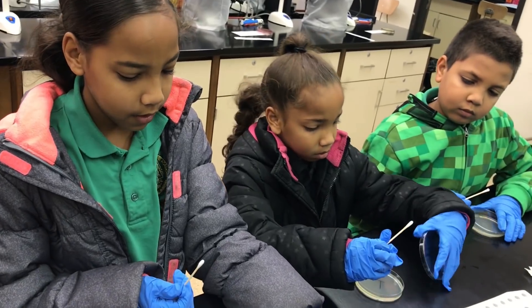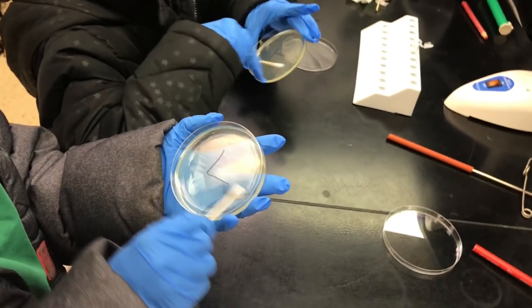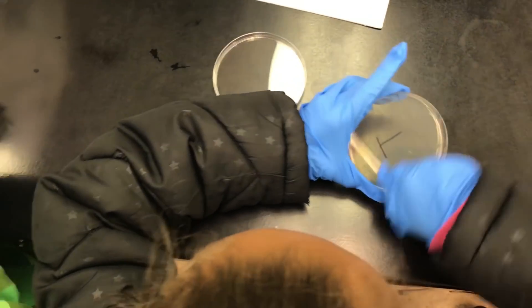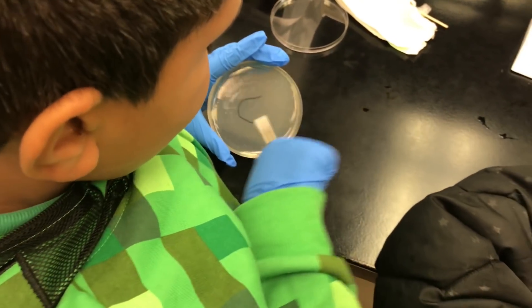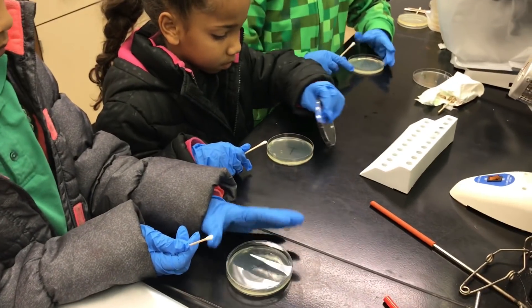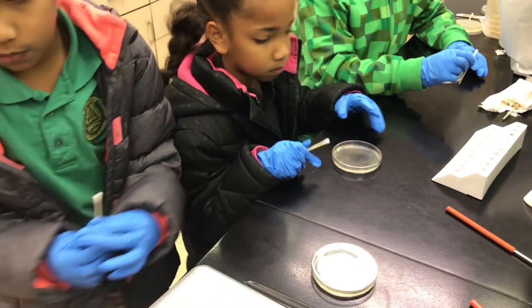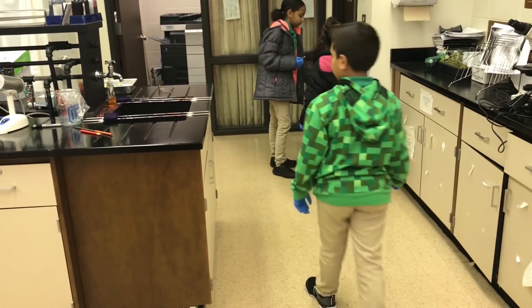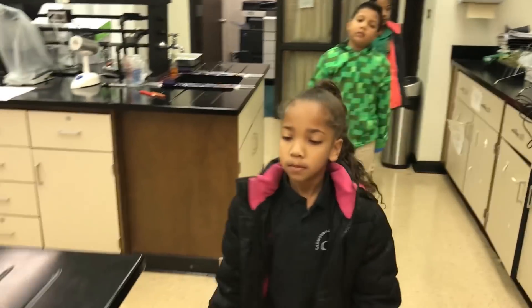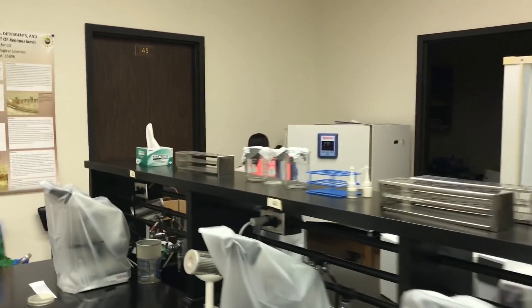That is good. We're gonna put it on a tryptic soy plate. Put it all on there. So now we're good — just close the plate. Let's put the swabs in the trash. And we need to put our plates in the incubator upside down.